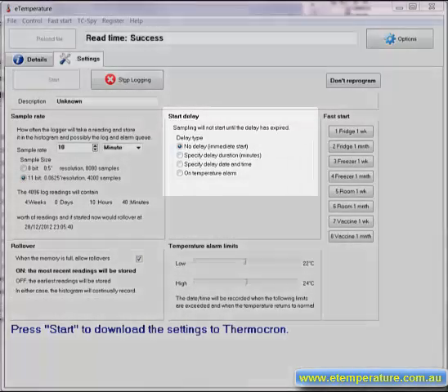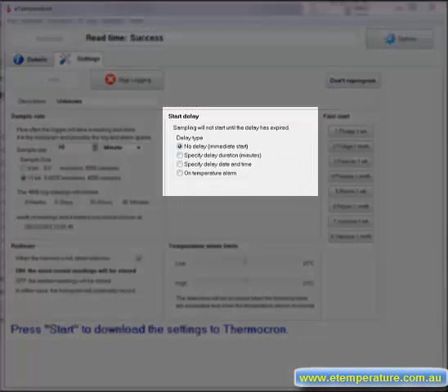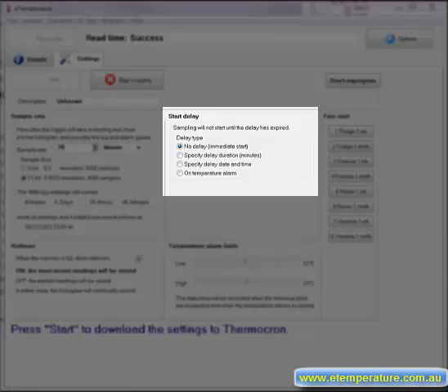The start delay is reasonably self explanatory. Most people will use the no delay feature so that the logger starts immediately.